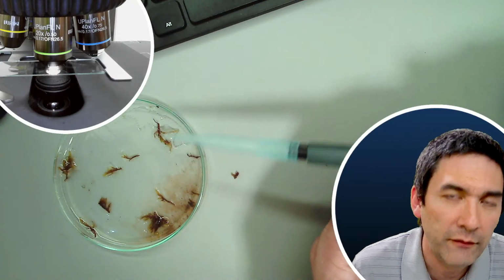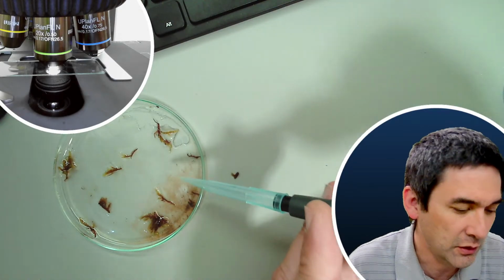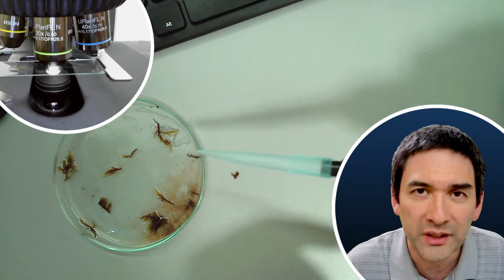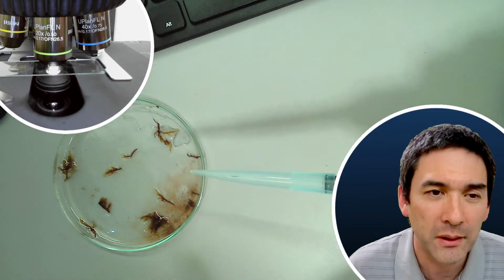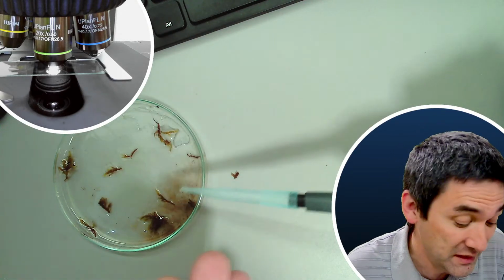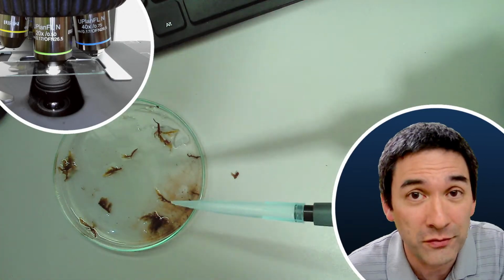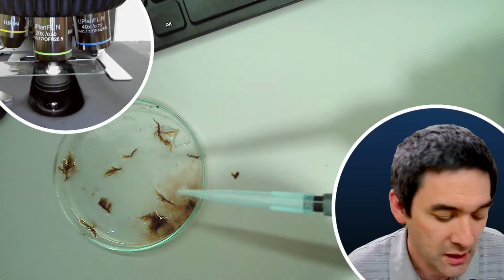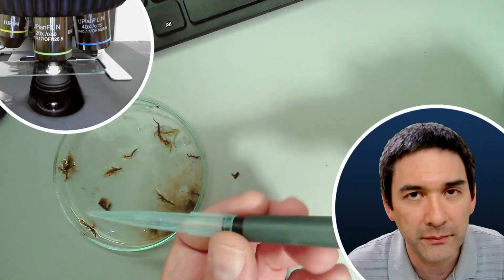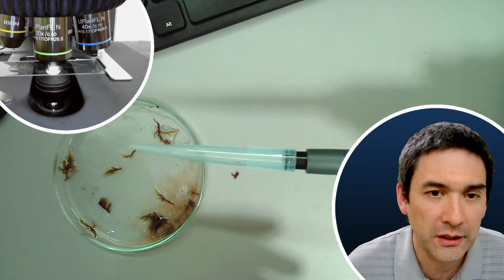But sometimes what I try to avoid, nevertheless, is using this pipette tip and then going over into another water jar, because I'm transferring microorganisms. Also not a big problem really, but I've had this before, some insect larvae in here maybe, or eggs of insects, and they start to hatch and then they eat the microbes of my other jar. So I want to prevent these things. If I'm using the pipette on the same specimen, of course I reuse it. Sometimes if it becomes too dirty, then I simply throw it away.